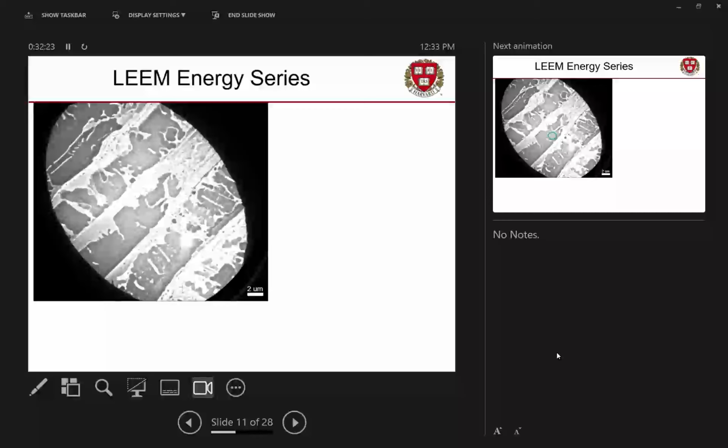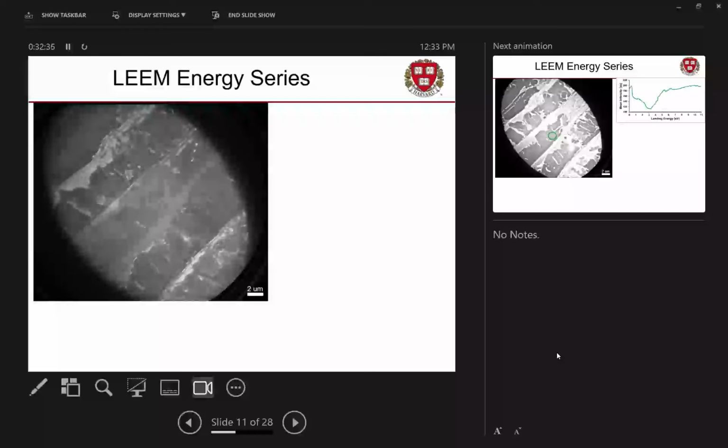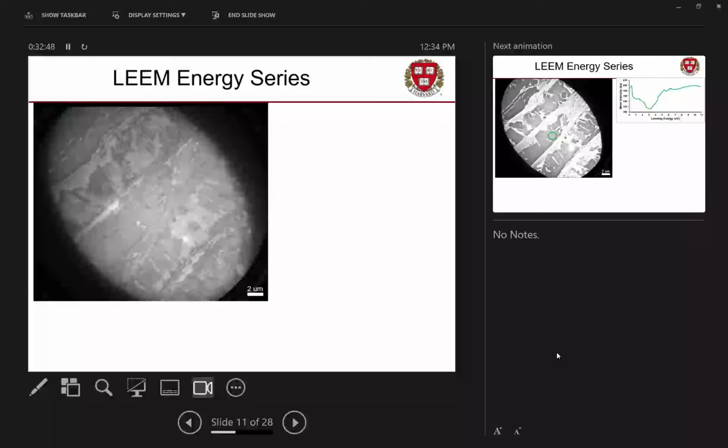So here's, now I'm going to try and play a movie in PowerPoint. So everybody pray for him. Here we go. Hey, all right, this is an energy series. Each frame is another 100 millivolts worth of electron energy. This is silicon carbide with graphene on it, and not very uniformly on it. You'll notice we've got a bunch of different areas. We've got some nice hexagonal edges on them because of graphene. We've got little spindly bits, and the energy is just going up and up and up, and we're working our way deeper and deeper into the graphene, and things are getting brighter and darker and so on. So this is a data cube. X and Y, and then the Z axis is energy.